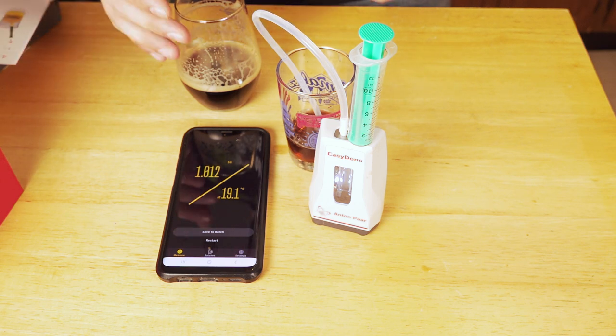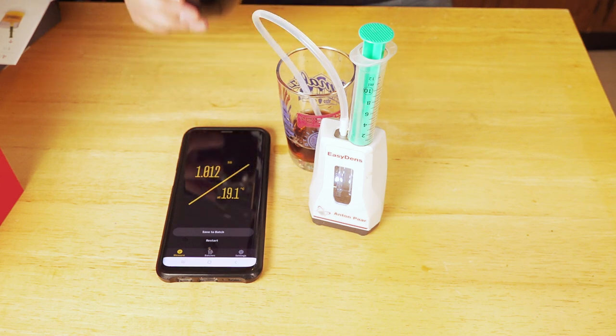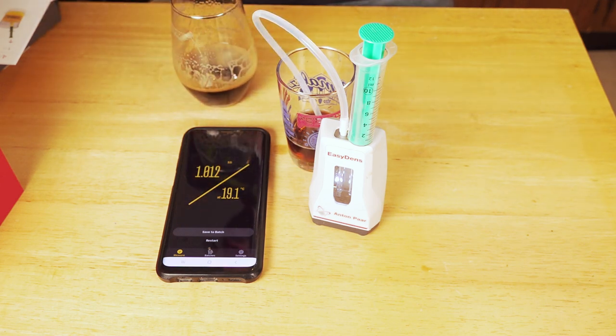Of course, you can also just shake the crap out of your sample and get as much carbonation out as you can — that'll work as well. But I just prefer the syringe method a little bit myself.